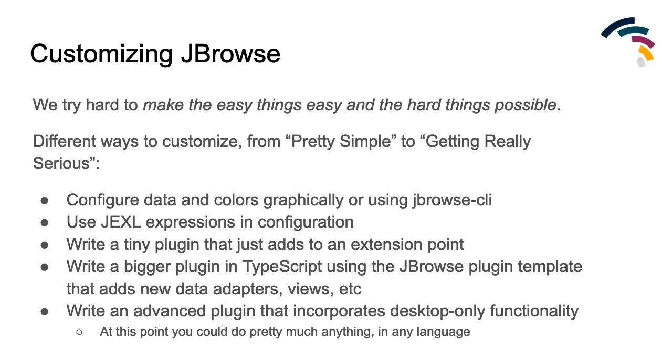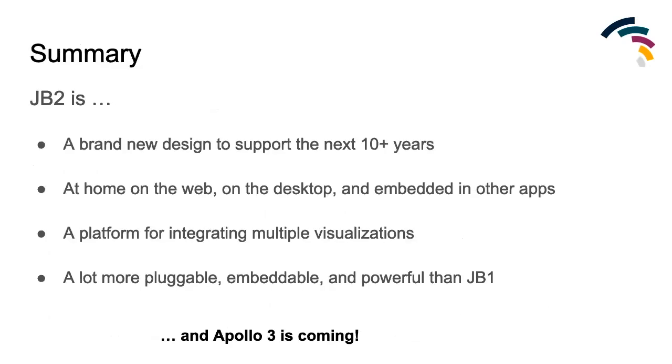Yeah, one of the big things that we do with JBrowse is we try to make the easy things easy and the hard things possible. How easy the easy things really are is debatable, but you can definitely do anything you might want, and we're here to help you make that happen. I'm not going to go through all the different ways you can customize it. We can talk about that more later.